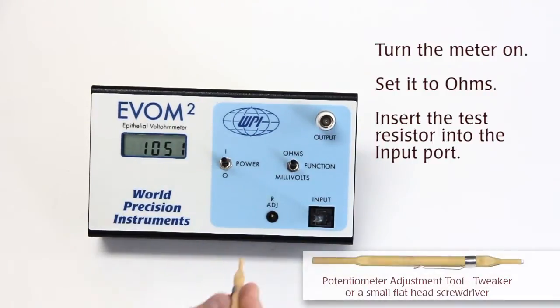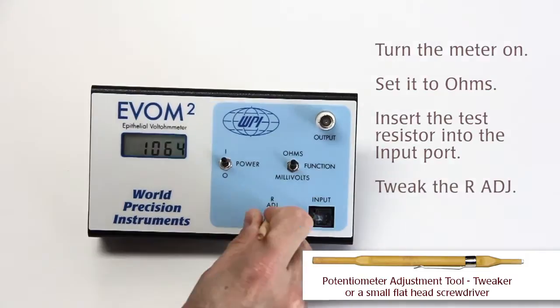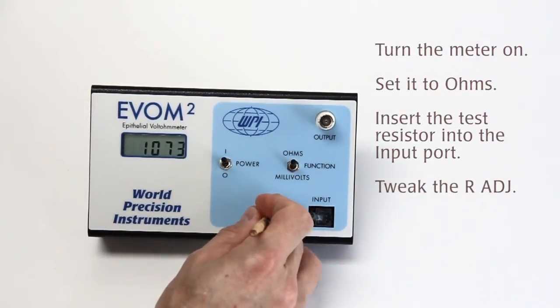That's not what we want, so we take the screwdriver, stick it into the R adjust location and adjust to 1000 ohm.